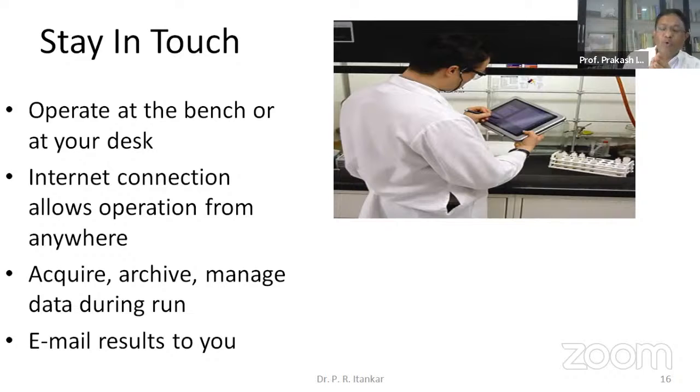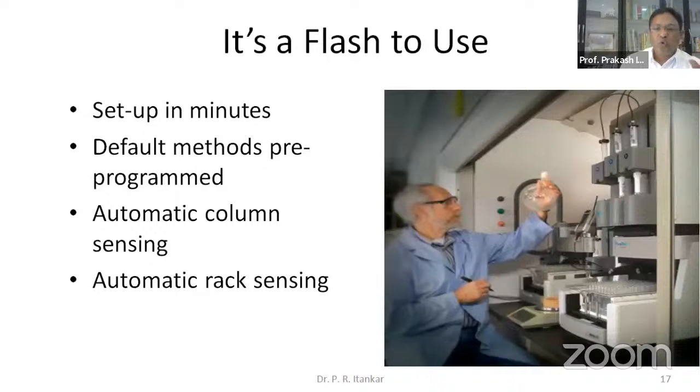Now, how will I know from which test tube number to which test tube number my compound is there? That message shall be given to me by the machine. So the machine tells you that from test tube number 15 to test tube number 25, compound A has dropped. So you can pick up only those 10 test tubes out of the crate of test tubes, and you can achieve the solidification or crystallization of that particular constituent, and move ahead further with that as a separated constituent.